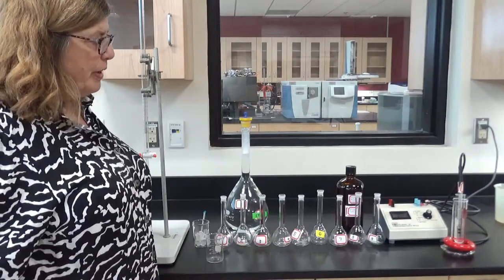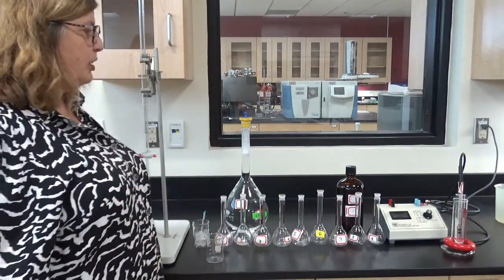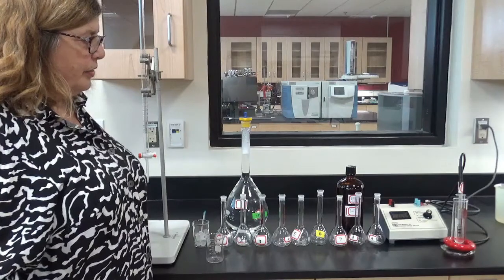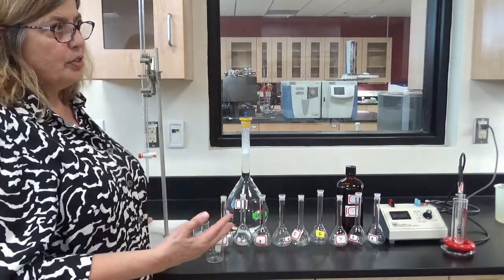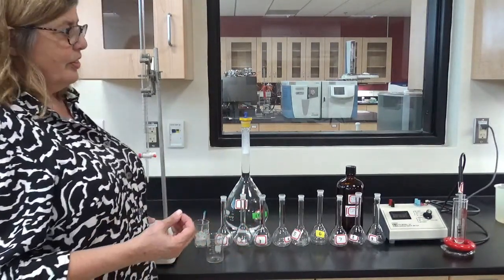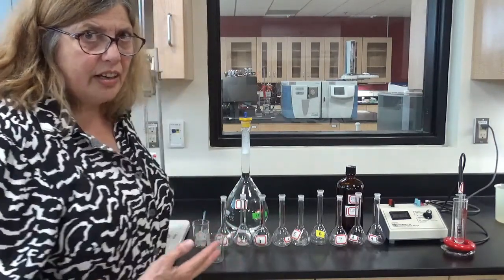We're going to measure 2 different properties. First of all, we're going to measure the conductivity of all those different solutions that we make. And the reason for that is, as you add monomers into the solution, you're adding something that's like sodium chloride. It's ionic, okay? So you're going to increase the conductivity as you increase that number of ions.